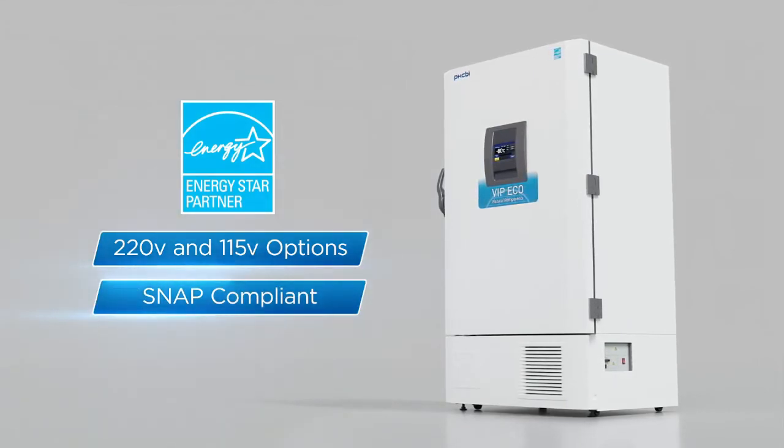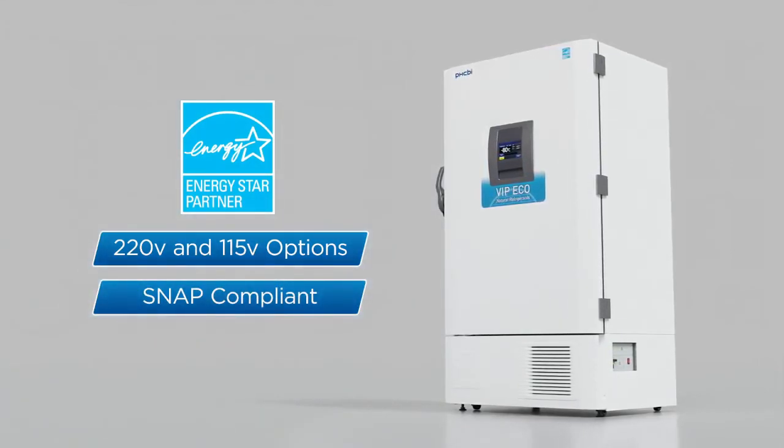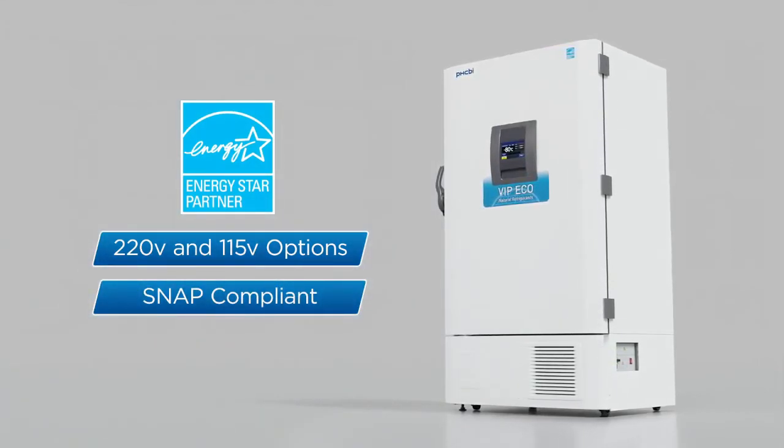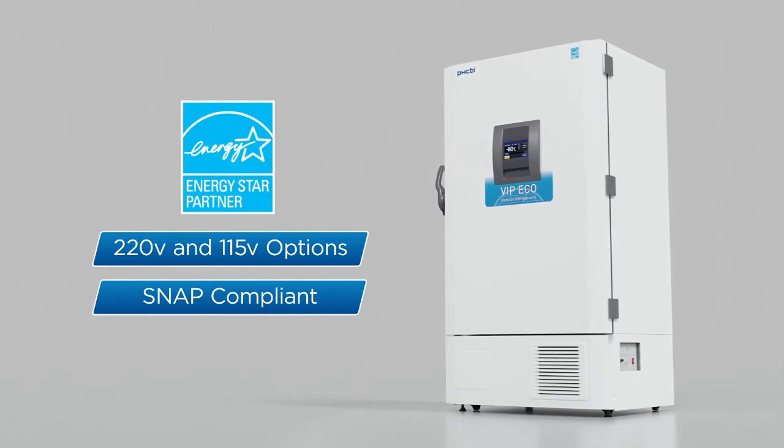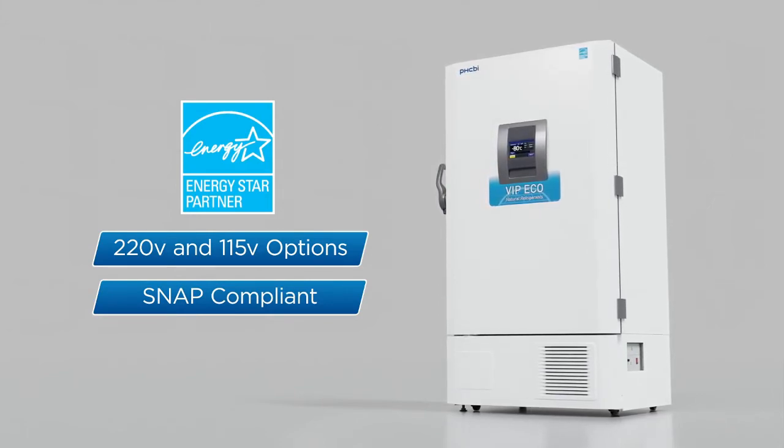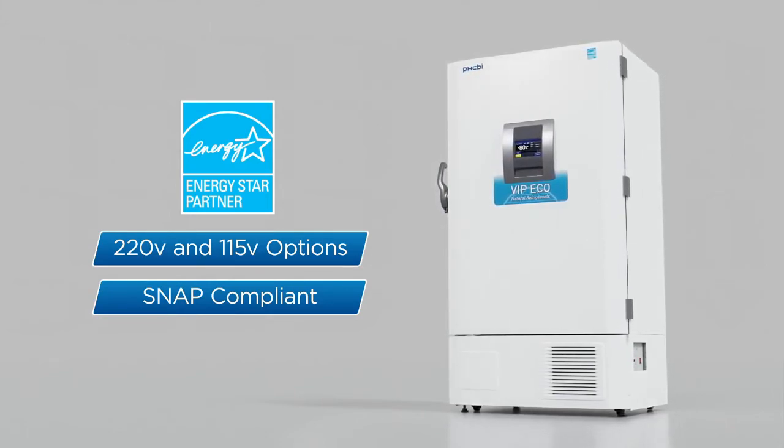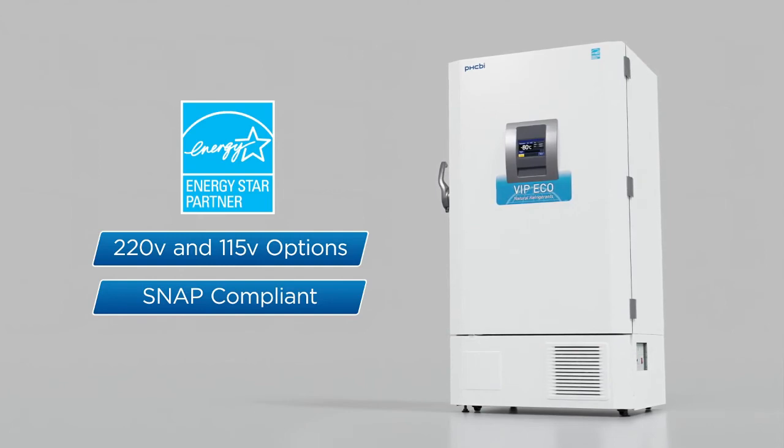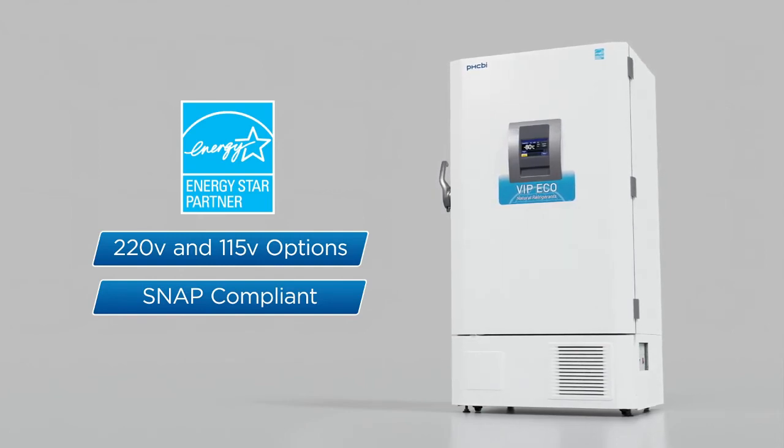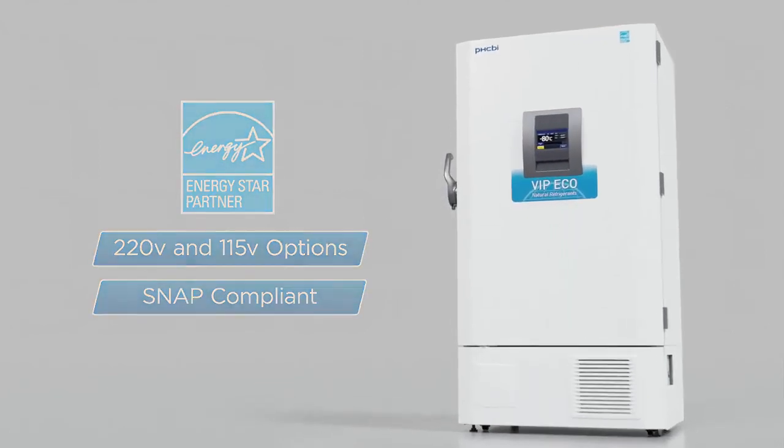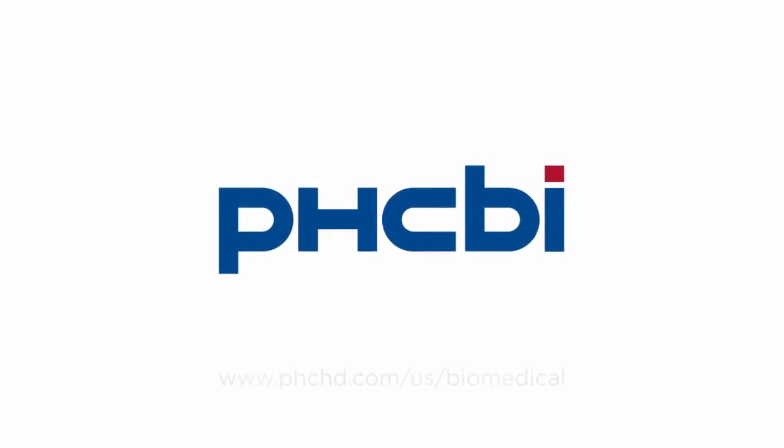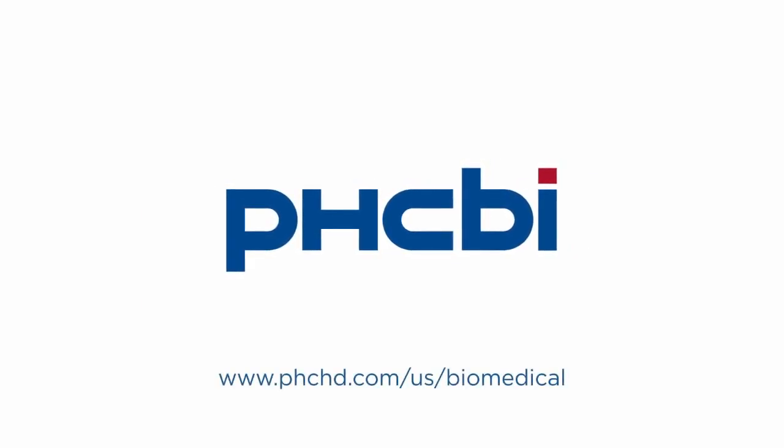The PHCBI brand products VIP eco is a fully integrated system that outperforms others by providing the reliability, temperature uniformity, and stability that your work demands. Call your local representative or visit us on the web for more information.